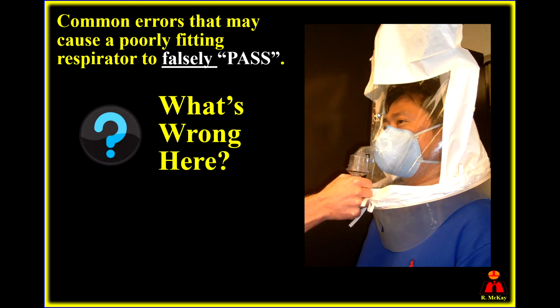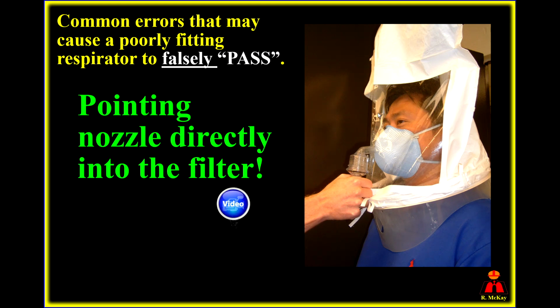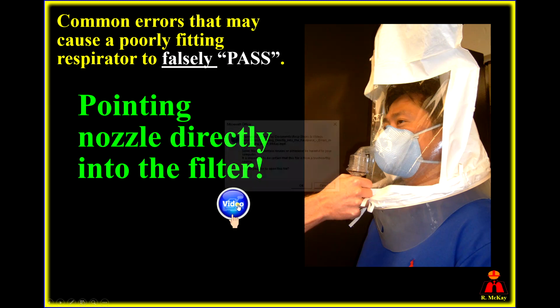In other words, don't do what's shown on the right part of this screen here. So what's wrong? Well, what's wrong is that the operator is pointing the nozzle directly into the filter. If you spray the aerosol directly into the filter, that diminishes the remaining aerosol concentration to potentially challenge that facepiece seal. Let's show a video that illustrates this for you.